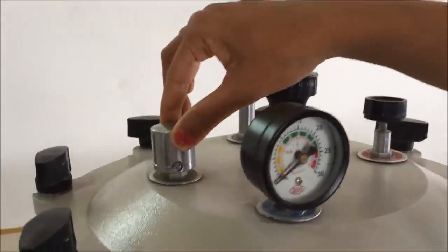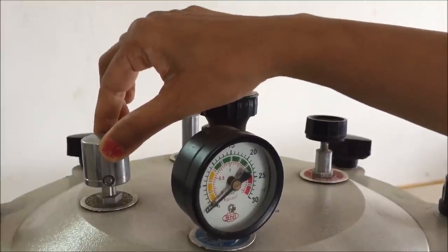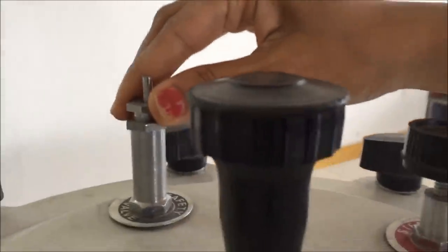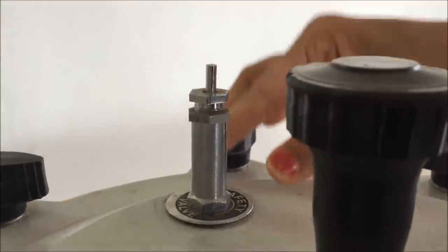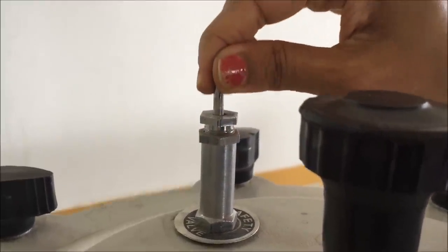This is a vent or vessel which works the same as pressure cooker. It releases the pressure on regular basis. This is a safety valve which provides safety and prevents the bursting or destruction of autoclave by excessive pressure.